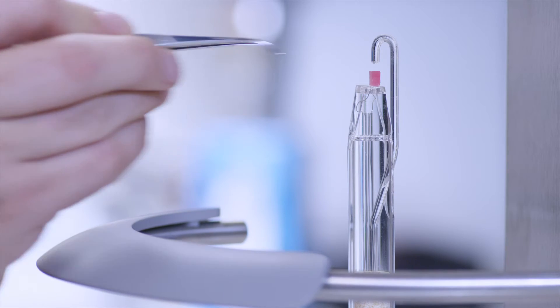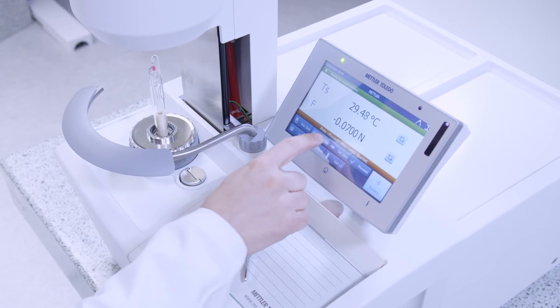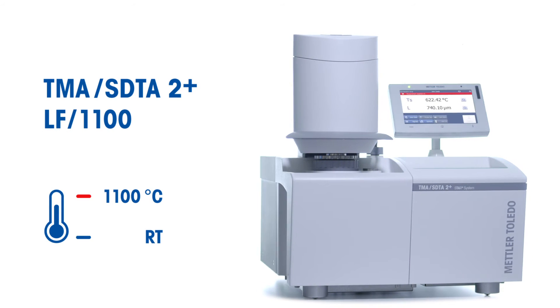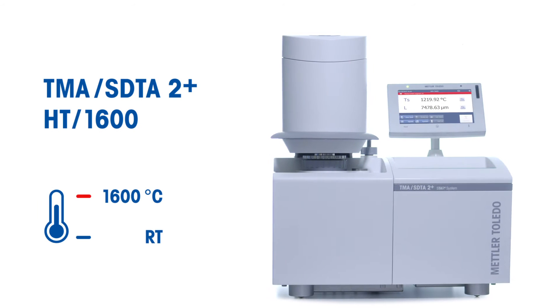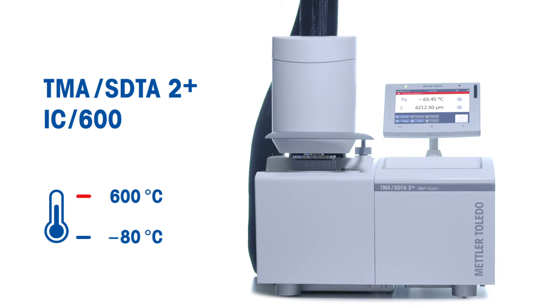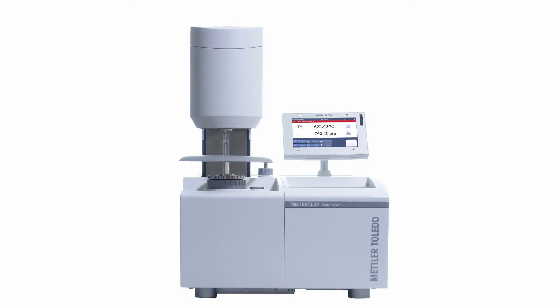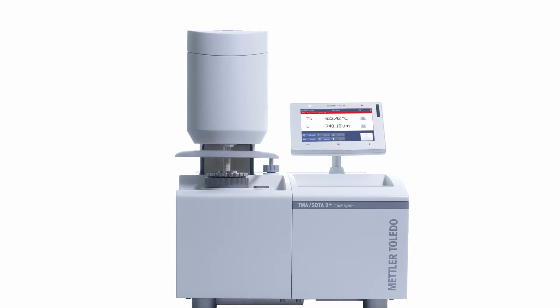To fulfill the different application requirements, the TMA-SDTA2 Plus is available in four versions: a standard temperature, a high temperature, an intra-cooler, and a liquid nitrogen cooling version.